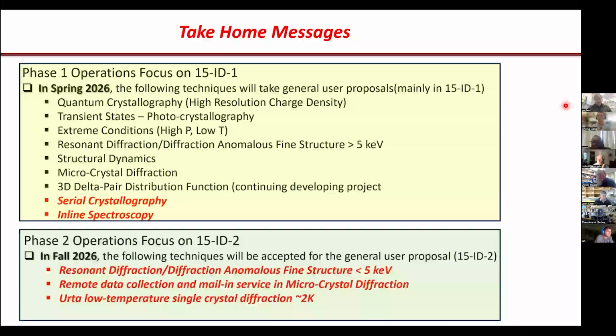Yes, but it would not be like the powder beamline, because of the optics and motors they have for the scan. We might not do as well as the powder beamline with their very fine angular resolution. In our case, it's probably 1 degree or 0.5 degree at some point.